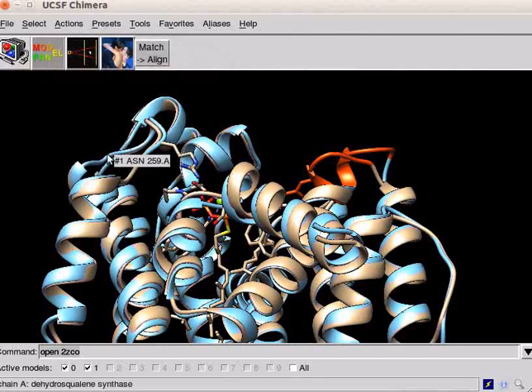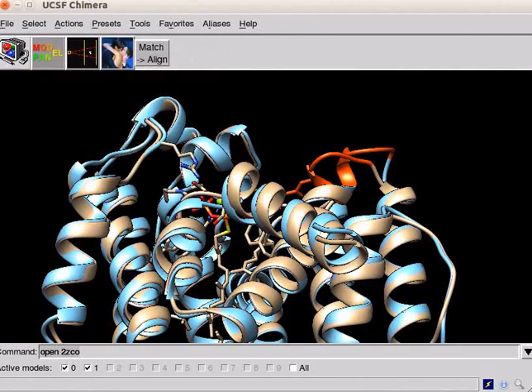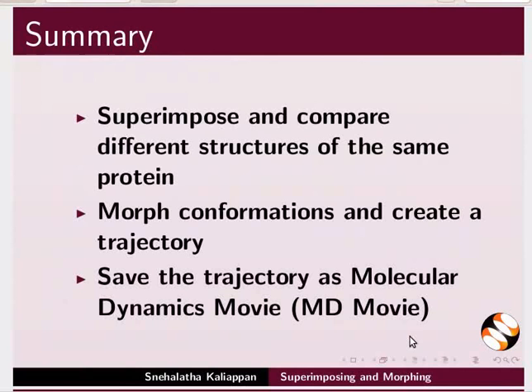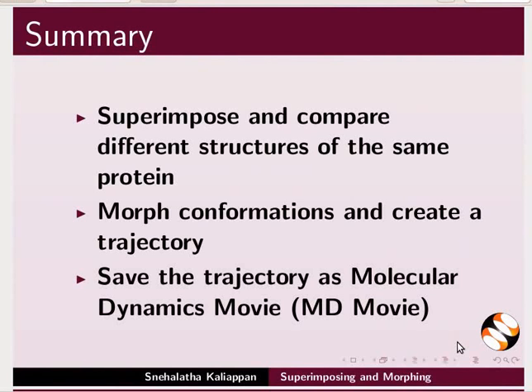Now let us summarize what we have learnt. In this tutorial, we have learnt to superimpose and compare different structures of the same protein, morph conformations and create a trajectory.